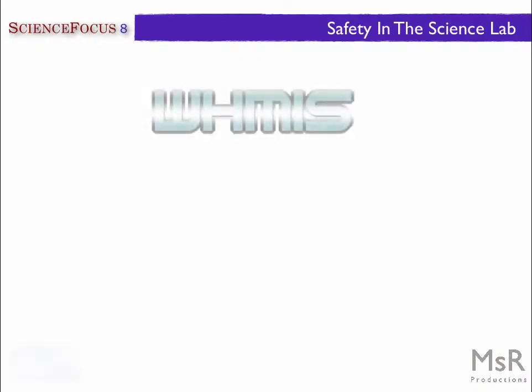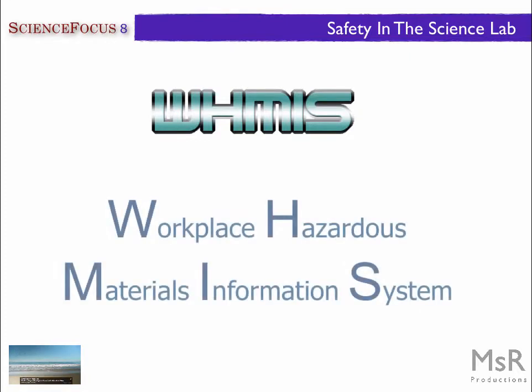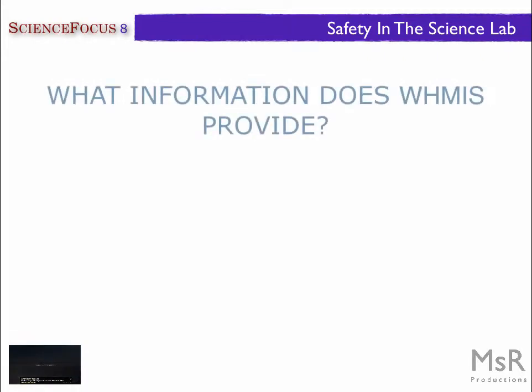Today we're going to be taking a look at safety in the science lab and WHMIS symbols. So what does WHMIS stand for? Well, WHMIS is an acronym, and it stands for Workplace Hazardous Materials Information System. And they are symbols for products used at schools in science labs.